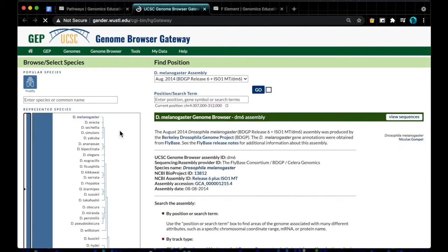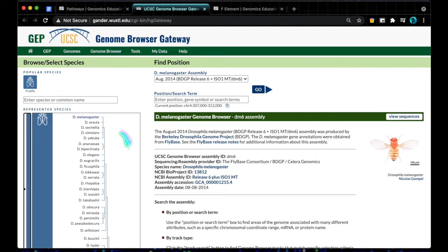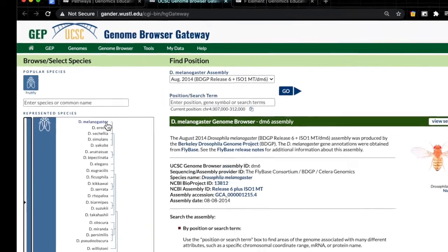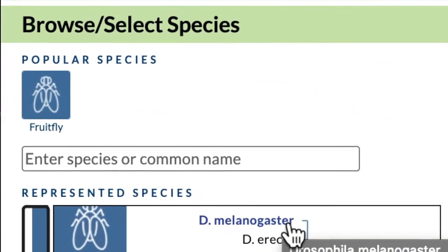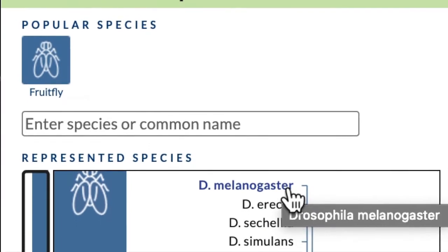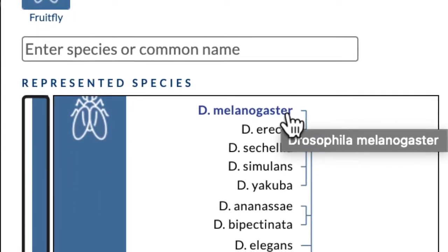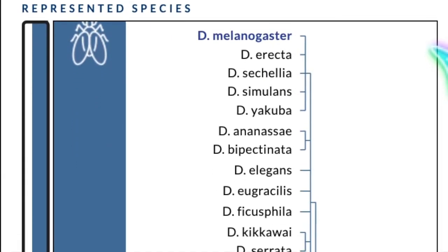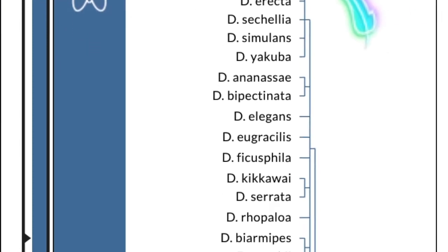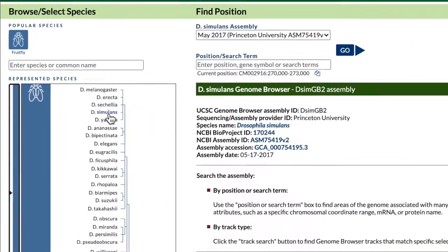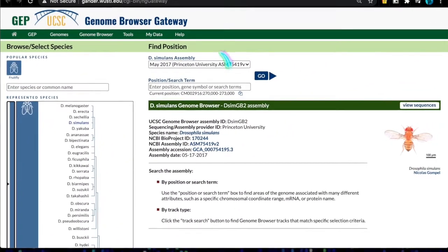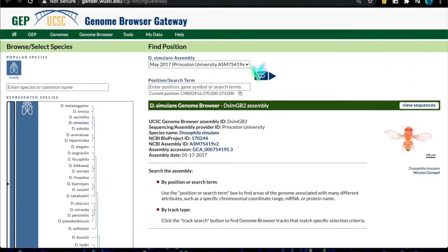Keep in mind that there are tons of ways to get here — this is just my favorite way. Now notice that the default for represented species is going to be D. melanogaster, but I'm more than willing to bet that you are not annotating something from this species, because it's already the most heavily studied one. So to make this tutorial most representative of something you'll actually be given, we'll go with D. simulans for now, and as for the assembly, just make sure it's the correct one.